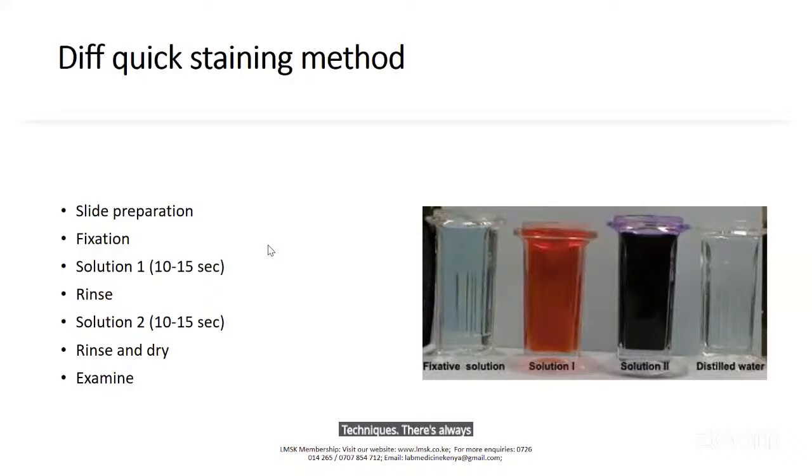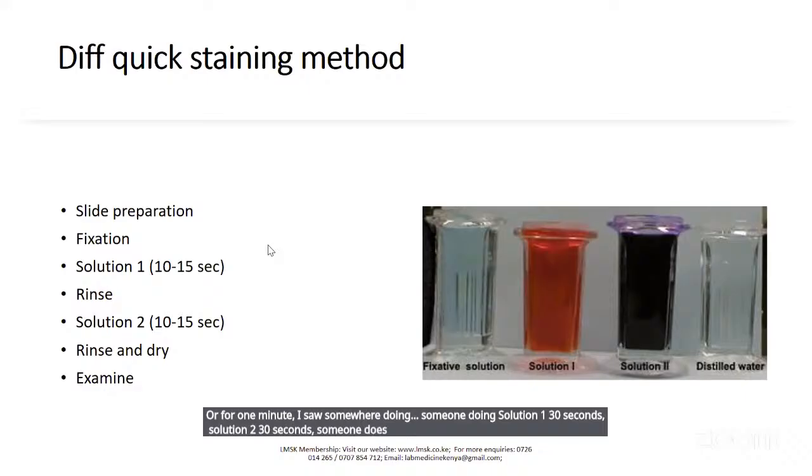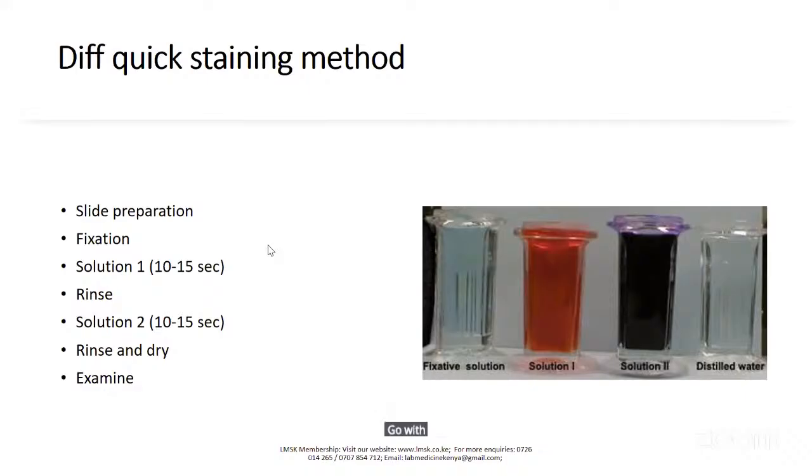So if a manufacturer says, do this for 5 minutes, do this for 8 minutes, kindly follow that procedure. What I'm giving you here is what is in the books. But if a manufacturer says you stay in solution 1 for 2 minutes or for 1 minute, I saw someone doing solution 1, 30 seconds, solution 2, 30 seconds, someone does 1 minute in solution 1, follow the manufacturer's instruction, because I won't be the manufacturer. I cannot dictate what they have prepared. So that's my take.